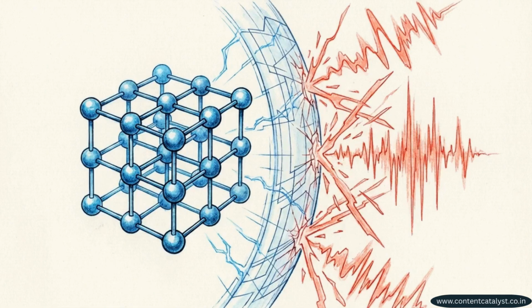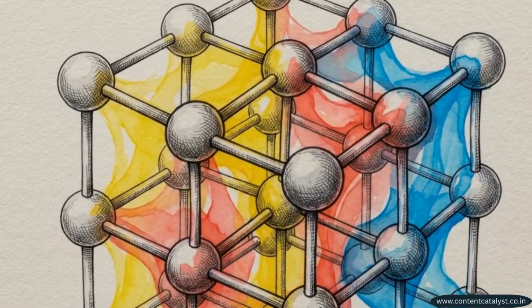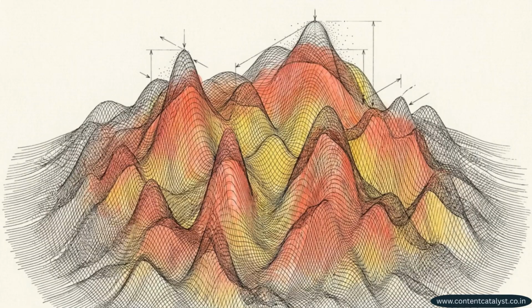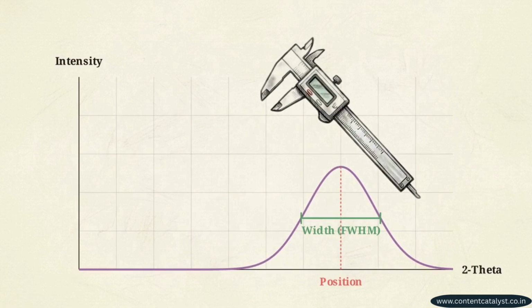Modern diffraction analysis increasingly relies on high-volume, continuous data, tracking a sample through temperature ramps, or capturing a battery actively cycling operando. Not every experiment requires a complete crystallographic map. Tracking a single peak's position and width is often enough to monitor a phase transition.